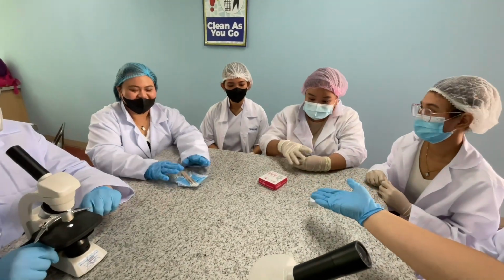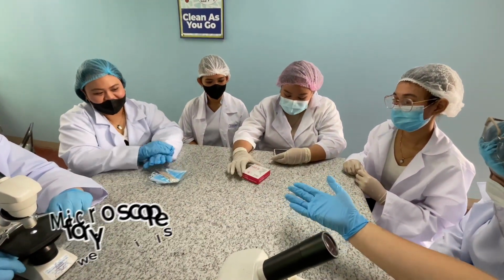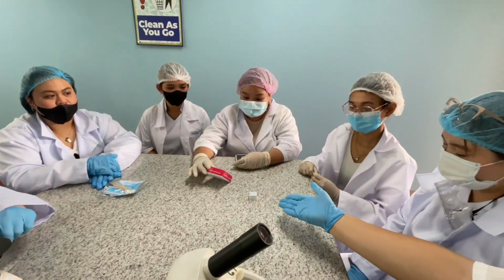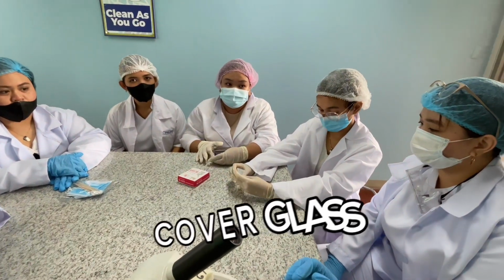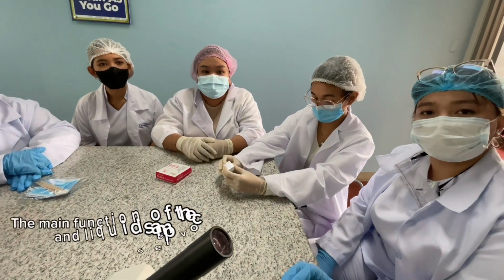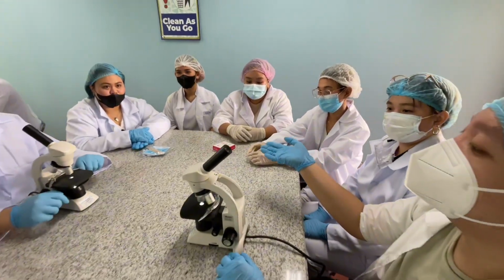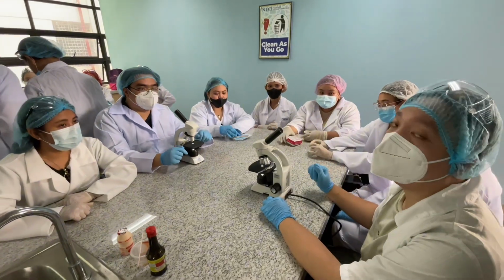And we have also, what is this? This is a microscope slide. Glide or pass smoothly through. The partner of the slides is the cover glass, which holds the specimen in place and protects it from contamination. Those are our small materials. And of course, without those, we cannot continue our experiment.